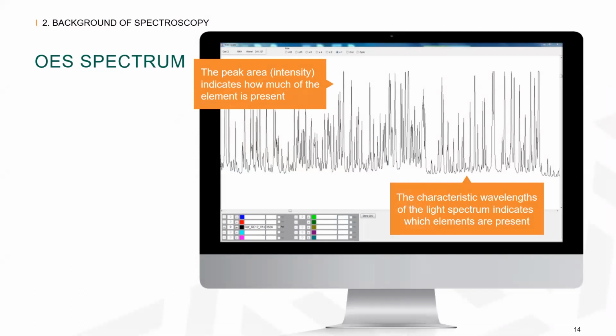Doing so produces intensities and wavelengths that correspond to elements of interest, indicating not only what elements are present, but the quantity of elements present.